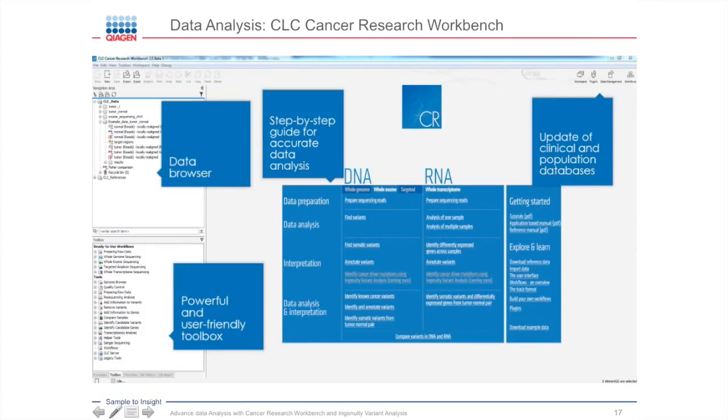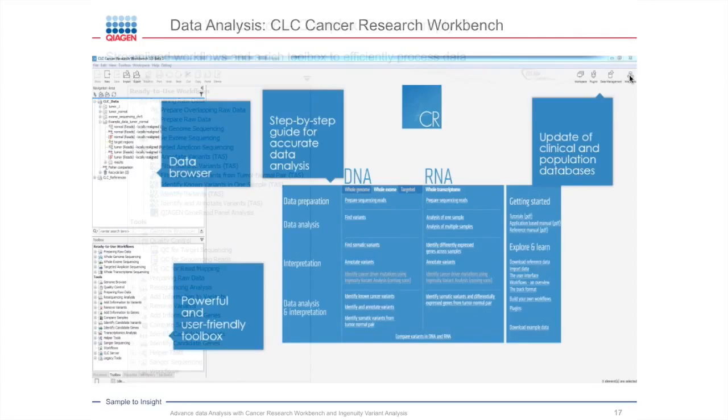In the right top corner of your workbench, you also have the different plugins to interact with other tools, such as variant analysis, such as IPA, such as the Genome panel, and so forth. You can actually access the workflow building tool, where you can build your own workflow should you choose to do that. And you also have data management, so how to download the different references that you may use. For the QIAGEN Genome panel, we are already providing you all the different references that you can download. You have the human references that will allow you to do your data analysis.